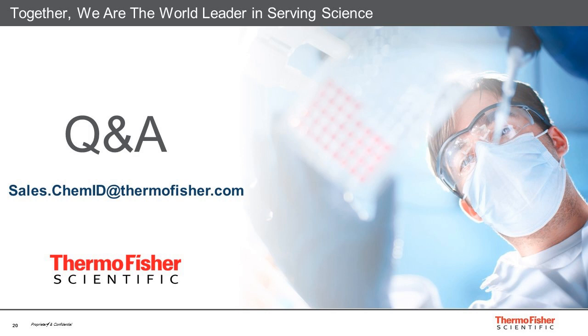The last question is, what laser and power does it use? Is this flexible and can it be changed? The TrueScan has a 785 nanometer laser, so it's a red laser. Right now, within TrueTools, you have 3 different power levels you can use: low power, medium power, or high power. High power is 250 milliwatts. So typically, TrueScan operates at 250 milliwatts anyway. If you need to drop the laser power down, you can, depending on the fragility or sensitivity of your material. That wasn't something you could do previously. This is something new.